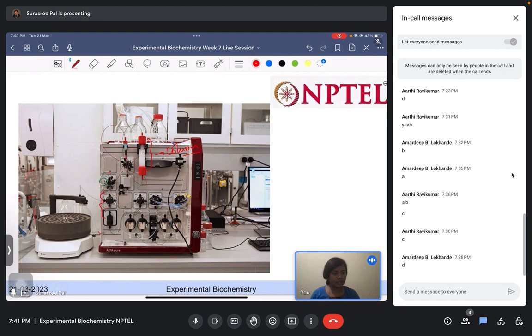Here in these bottles you prepare the buffers, you keep the buffers in these bottles, and there are these wires you can see. These wires will be taking the buffers through the protein column. Here you can see this is an affinity column, because you can see it is blue in color. Usually the blue color comes from the nickel, since the affinity column contains the nickel matrix.